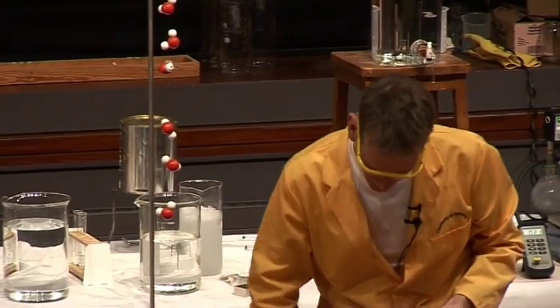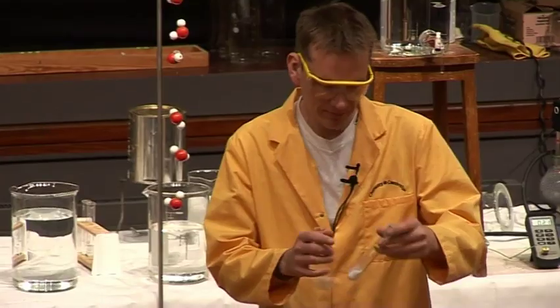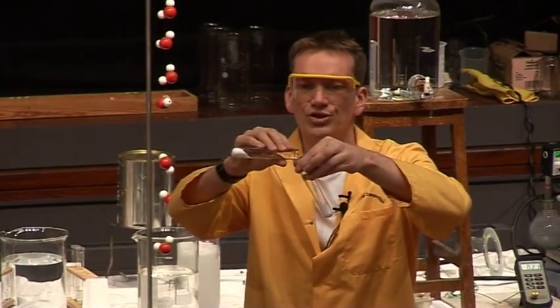These are potassium iodide and lead nitrate. Just mix them, that's better. And when I mix these, we should see a reaction taking place. I'm going to pour the two solids together.